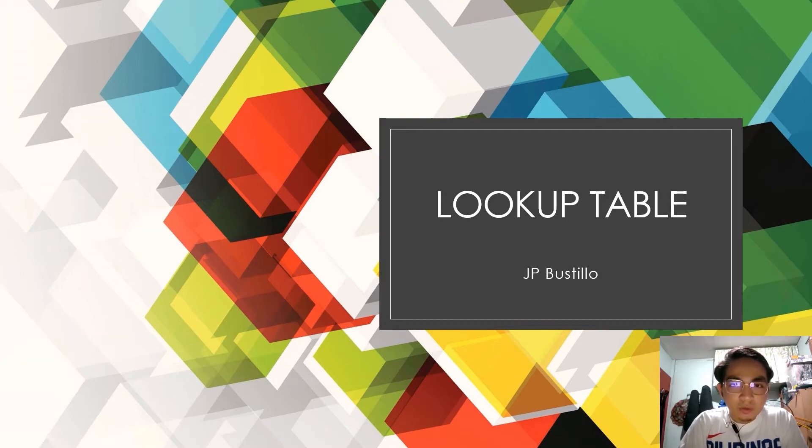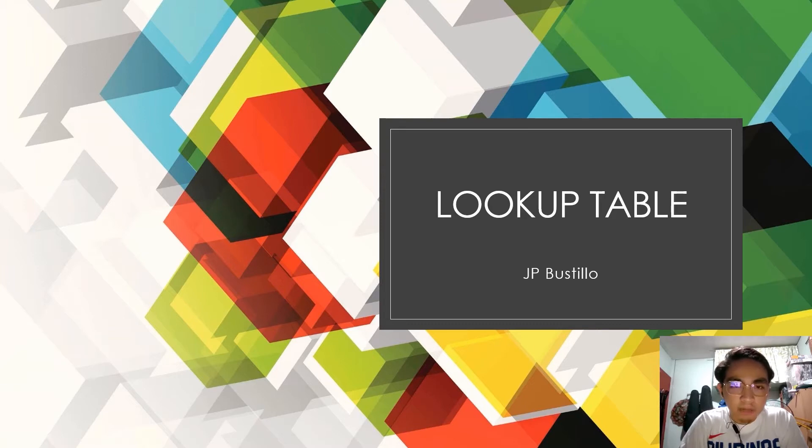In this lecture, we will define Lookup Table and show how it is done in ImageJ. Let's start.